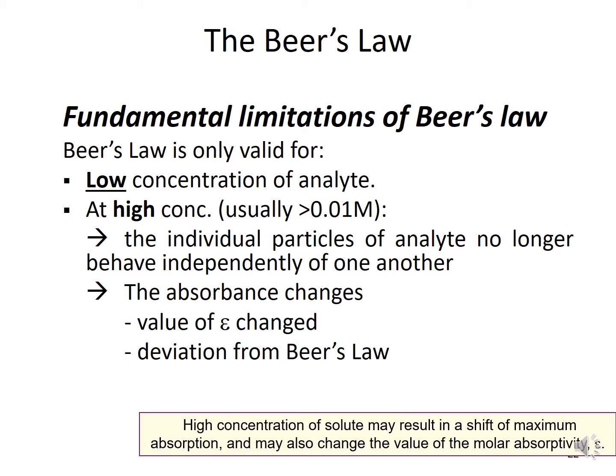We can say that a high concentration of solute may result in a shift of maximum absorption and may also change the value of the molar absorptivity epsilon.